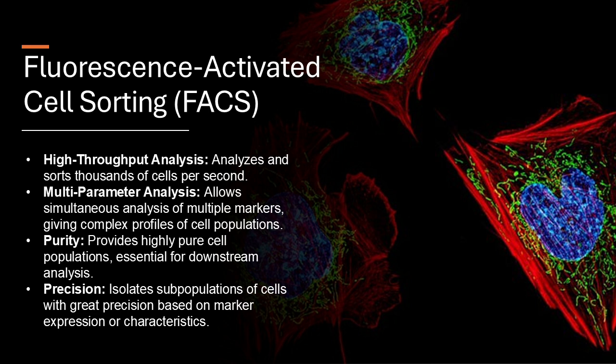What are some of the big questions that researchers are still working on using this technology? Well, one area of research is developing new fluorescent probes that can target molecules inside cells, not just on the surface. So we're going even further, beyond the membrane, to see what's happening inside. Exactly. This would allow us to study processes in much greater detail and could lead to new drugs and therapies that target specific molecules or pathways within cells. It seems like the possibilities are endless.